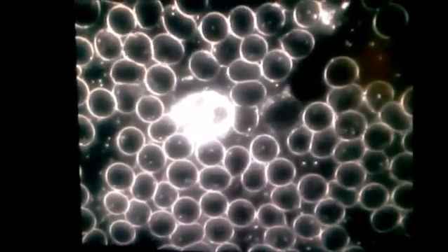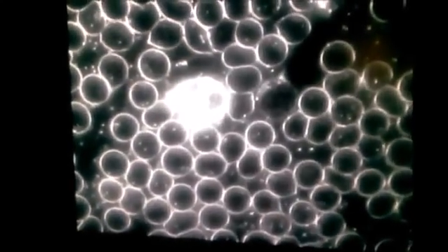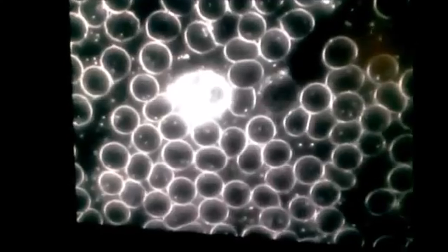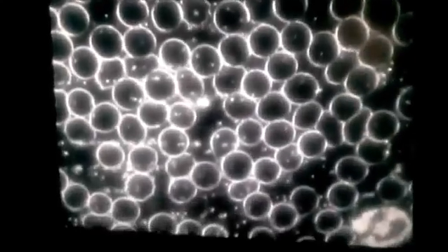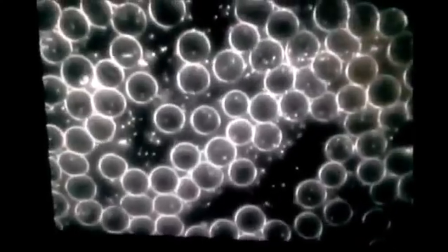Here you see the blood 30 minutes after taking the RAIN product. The red blood cells, which are the round bubbles, are free and clear of each other — they're touching, but they're not sticky and overlapping. In the center, we see another white blood cell, and it's in good form. The white blood cell actually moves around throughout the blood seeking bacteria, red blood cells that are malformed — which are your free radicals — and they either digest it for more energy or use it to clean up bacteria, parasites, and whatever else is going on in the blood.